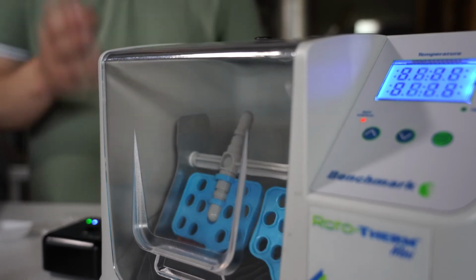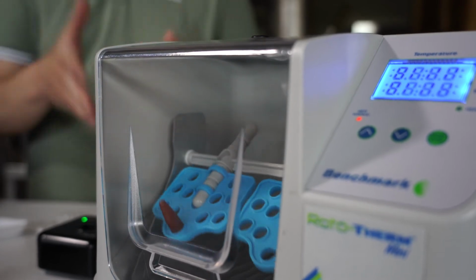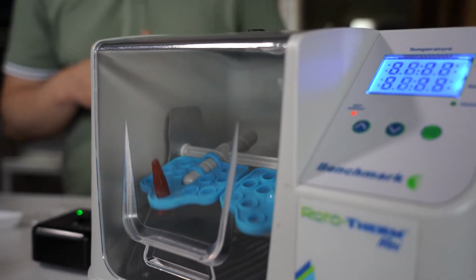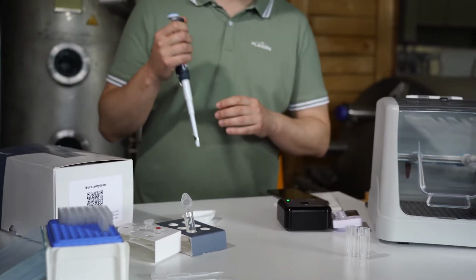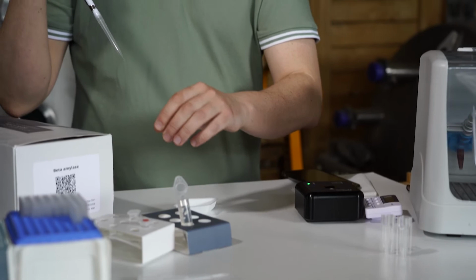Now it needs to incubate for exactly 7 minutes, or as close to 7 minutes as you can, because we are measuring an enzymatic kinetics, so time is critical in this measurement. So in the meantime, while this is incubating, we're going to prepare what we call the reference of the sample. That is to cancel any color of the sample.